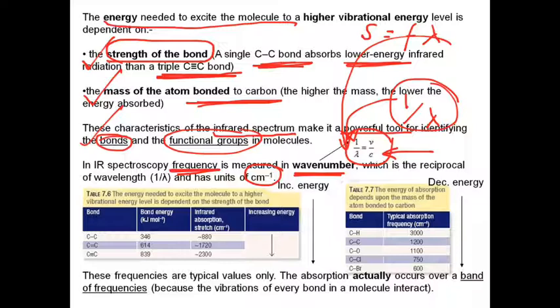Now, at the bottom of this screen, there are a few little things described. You can see that as the bonds get stiffer and stronger, the bond energy, I'll talk about it in the next screen, the frequency of absorption of IR radiation is higher. Don't worry about that. That's just increasing energy and increasing frequency of IR energy absorbed.